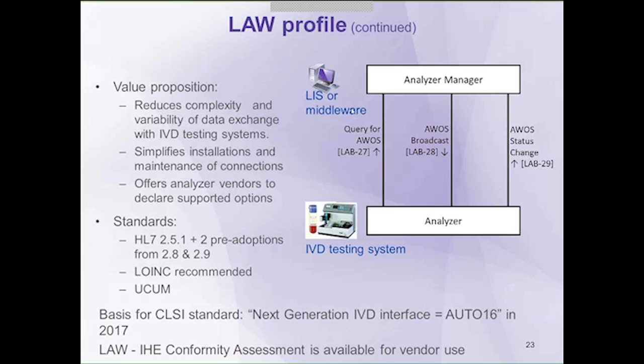So the LAW profile basically harmonizes the needs across the different vendors. So all the vendors that support the LAW profile use the same data elements, understand the same data structure when they're using LAW. So it simplifies installation and maintenance of connections to all those different test systems that you have to have in your laboratory.